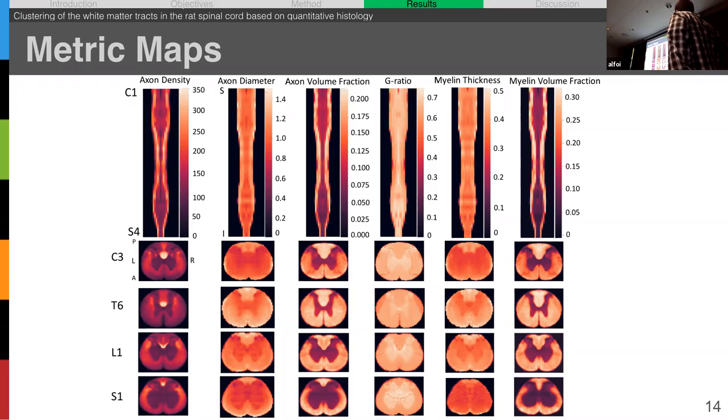What are the issues that you mentioned? Yeah. So, for fixation specifically, or for staining in general? So what we end up getting, these are perfusion fixed, so theoretically they should be more homogeneous in terms of fixation. So we shouldn't see too many variations.